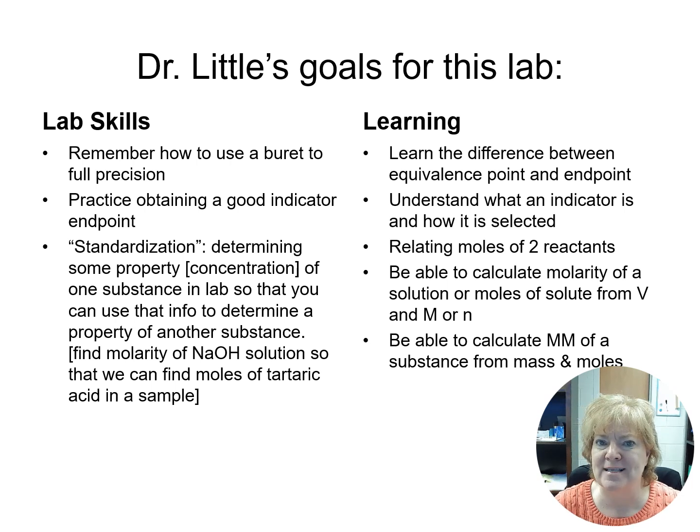We're also going to learn this general technique called standardization. The idea is that when I start using a chemical, I probably only have an approximate idea of its concentration or its purity, and I have to double check it. So we always begin labs with this process. This is a very typical technique.